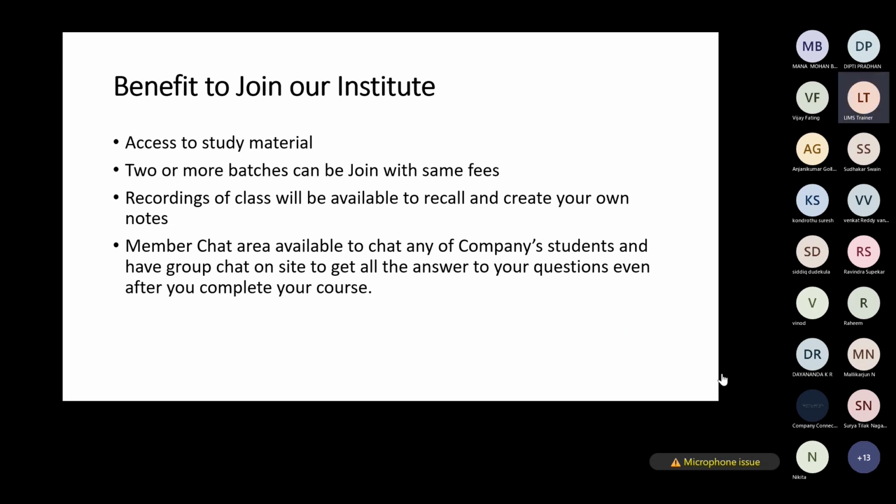You cannot just name one, but they'll train you. Each of them will train you their own way. Almost all of them are the same. The procedure is the same, but there are differences in the UI, and some differences are there, right? Like in Advantage, LabWare, and other LIMS tools. Different vendors mean different UI, different styles.